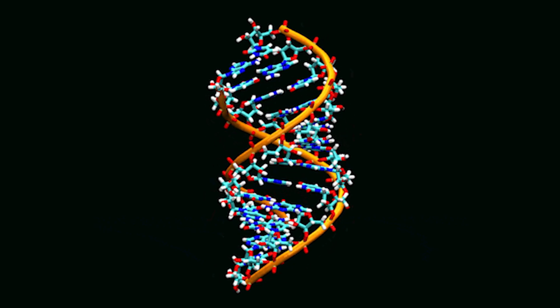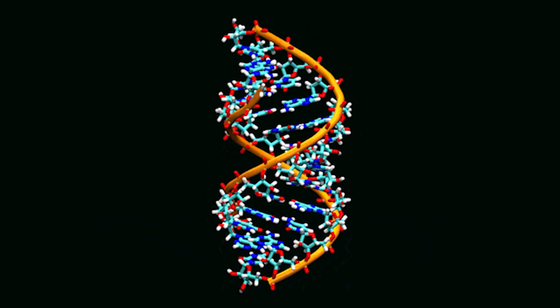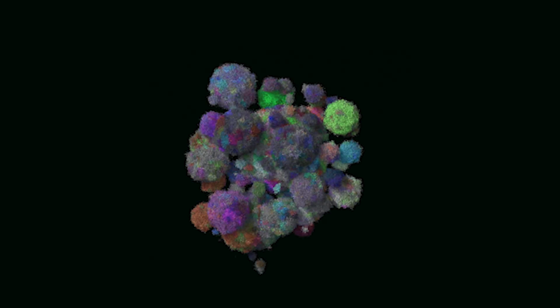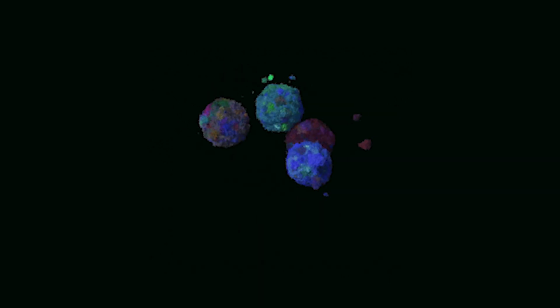RNA-Seq, the go-to technology for gene expression profiling. It lets us look at various types of RNA that's transcribed in an organism. This can be used to gain insight on a biological process or a disease state, like cancer, for example.